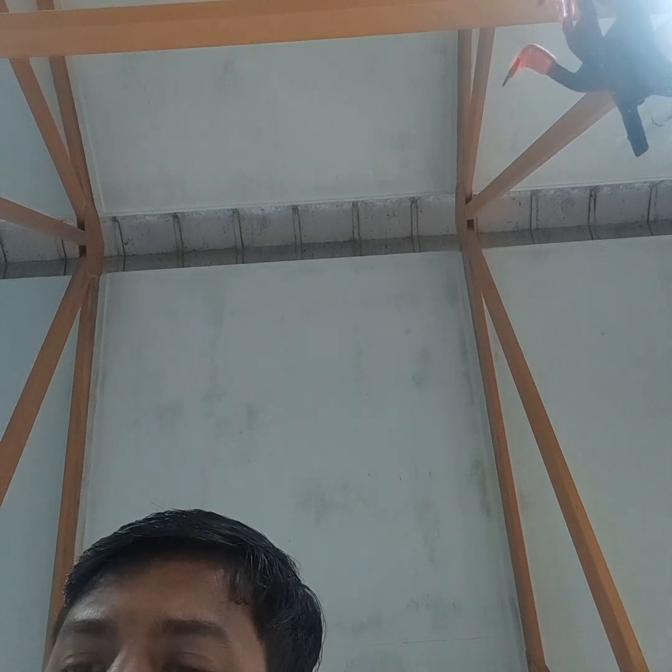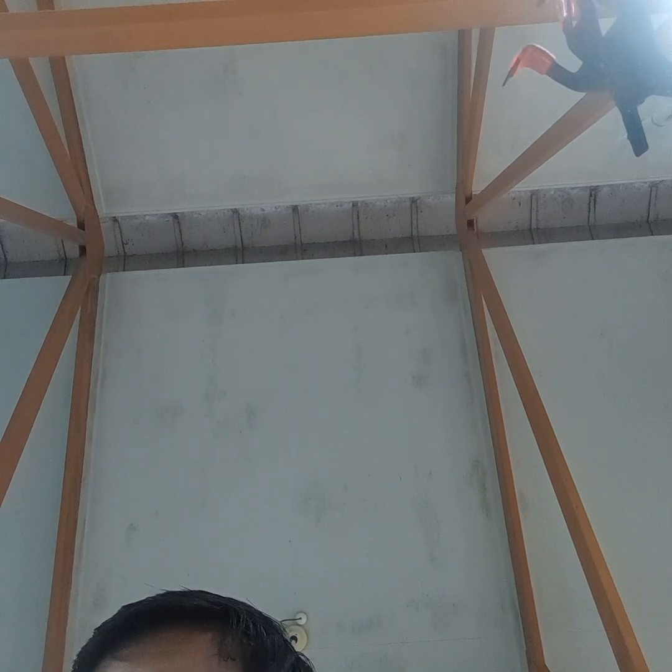Ten to the power of negative 2, and the temperature from 22 to 22. So the correction factor for the viscometer, you do it for each temperature.